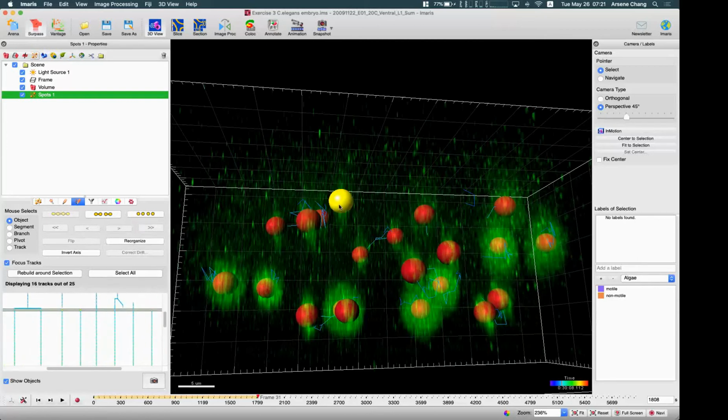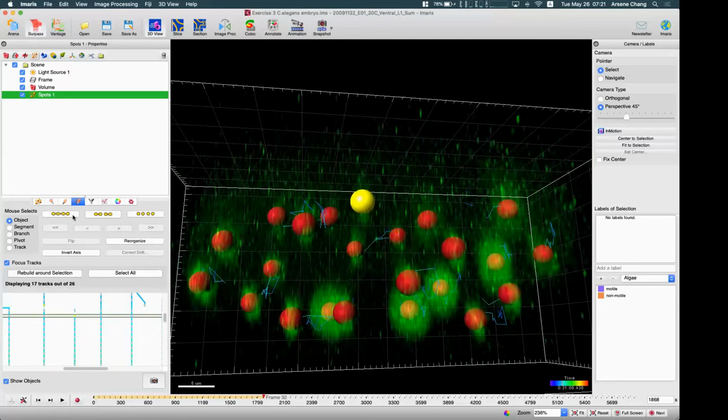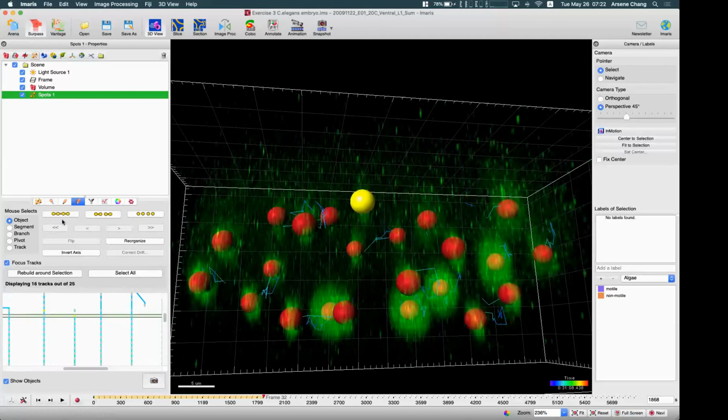Okay, this one I need to break also. So from this one, I need to connect to this one and this one. Sorry, I'm just trying to get this down. So I can connect this one and this one. Okay.